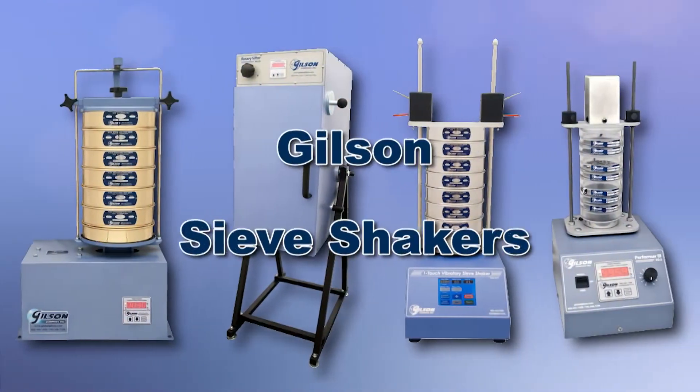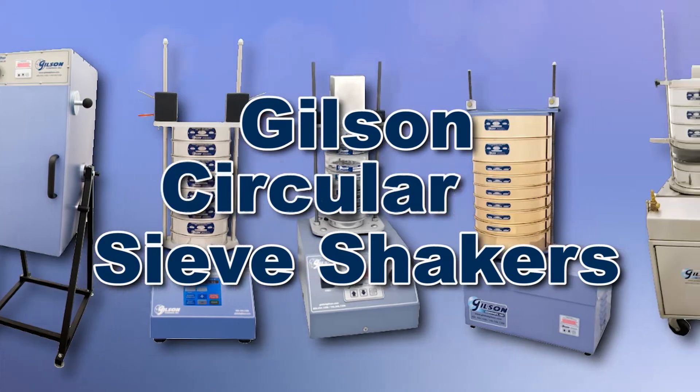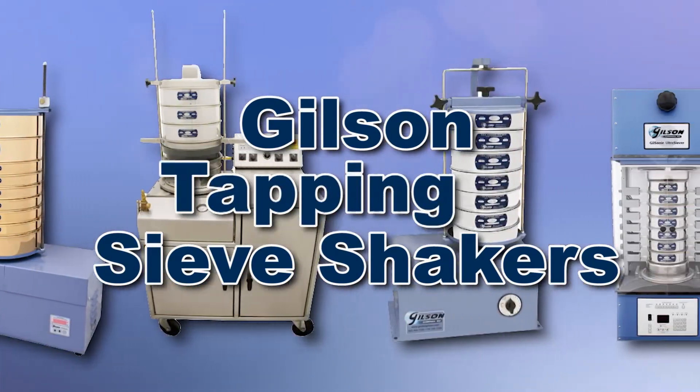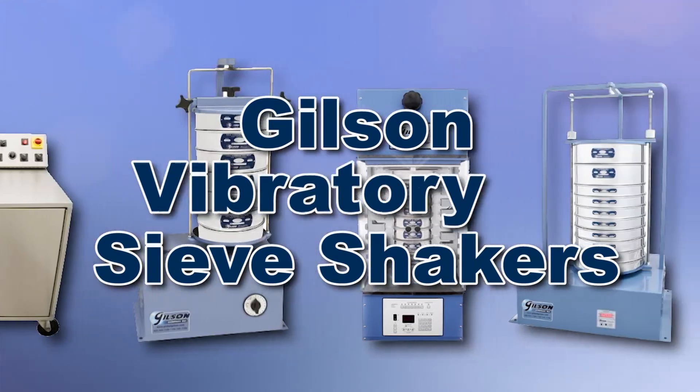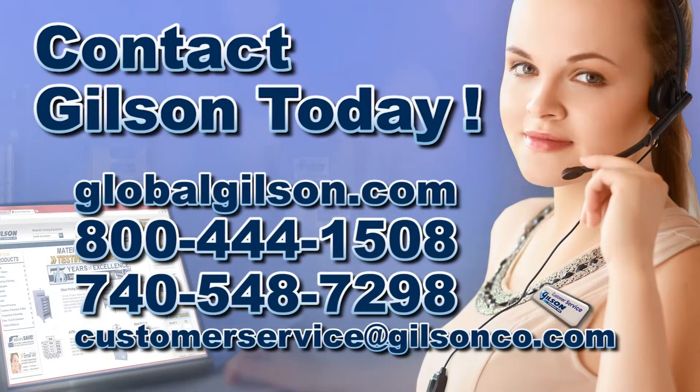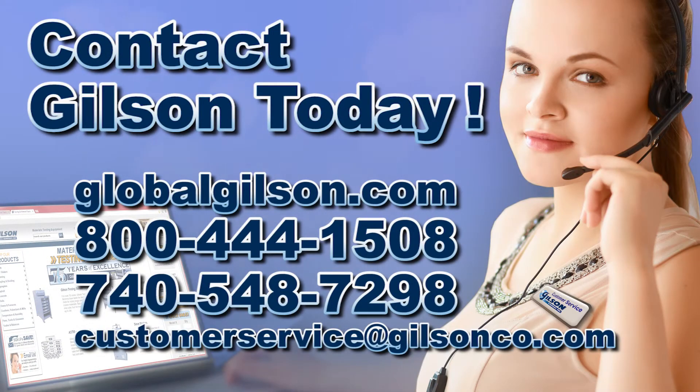With Gilson's complete family of sieve shakers offering a wide range of performance, features and capacities, Gilson has the right equipment to fit your needs for fast, accurate and reliable sieve analysis. Be sure to check out these and all our sieve shakers listed in the Gilson catalog and on the Gilson website.